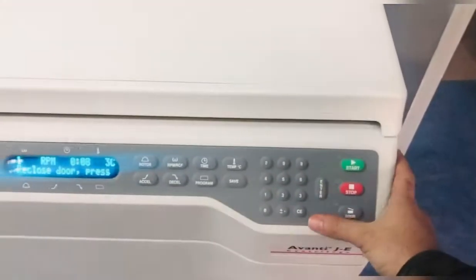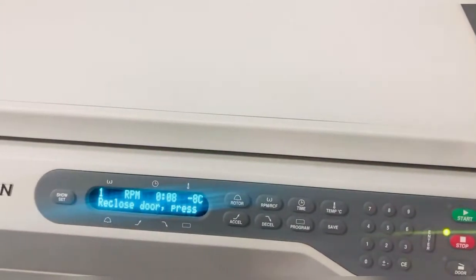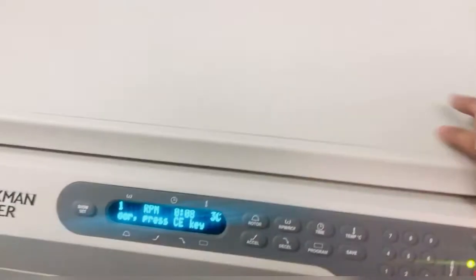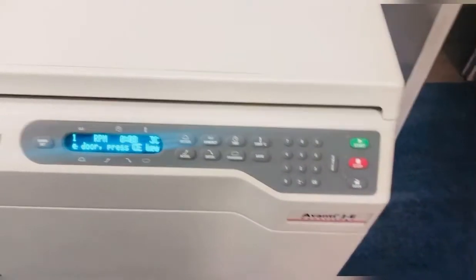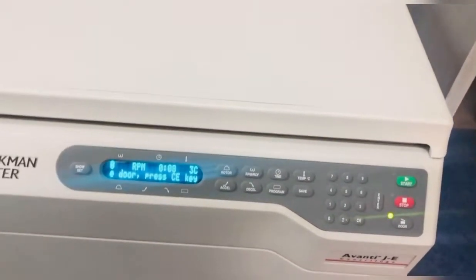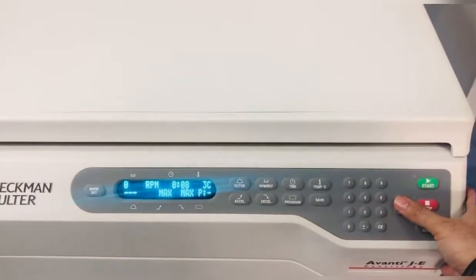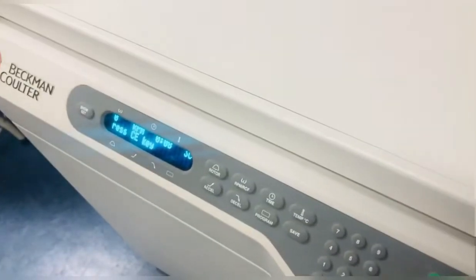It may have some problem. The lid seems closed. So I just need to power on and off because my machine has some problem, but that's not the proper way. I should try once again. This is the power on and off button — I'll try to power on and off again.